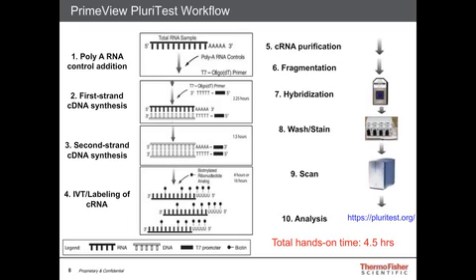This is the assay workflow. Poly-A controls are added in the beginning, which helps track the entire workflow. The assay starts with the first and second strand cDNA synthesis. The next step is the in vitro transcription coupled with biotin labeling.